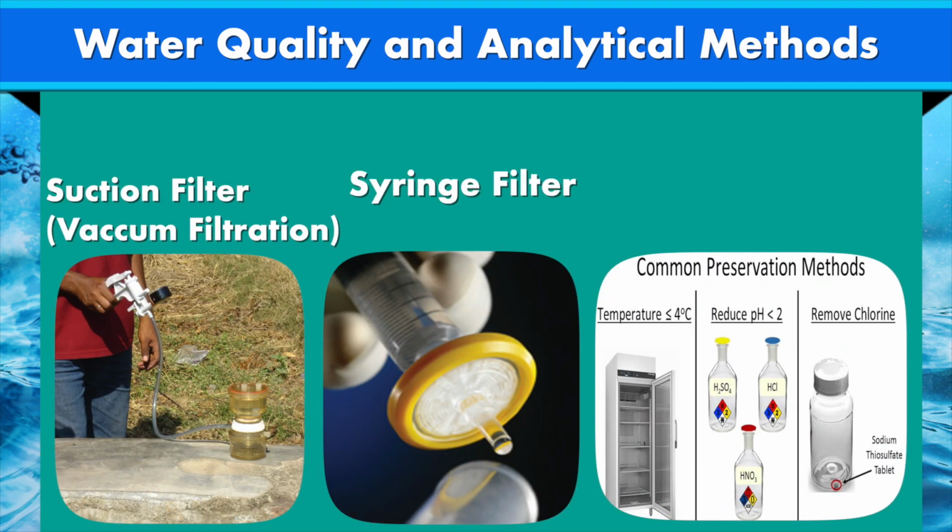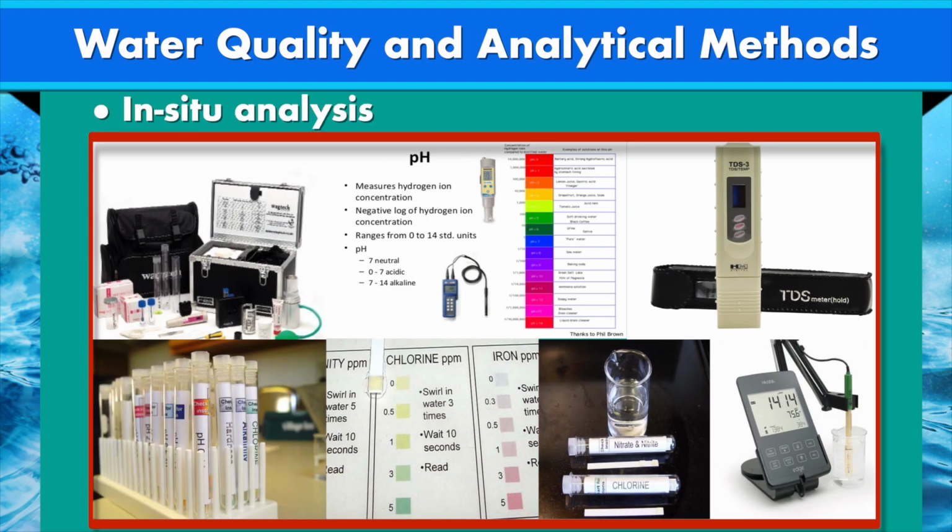For a few parameters, samples require in situ filtering and preservation. The Gran plot method is used for determining the bicarbonate concentration in situ.